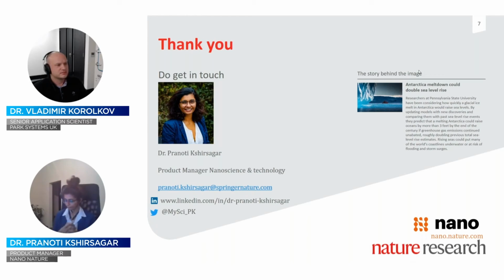Right, thank you, Pranoti. Another couple of questions for Vladimir. Firstly, one from Natalie. She says, thank you, Vladimir, for your presentation. Is it possible to image in liquid media using eigenmode?